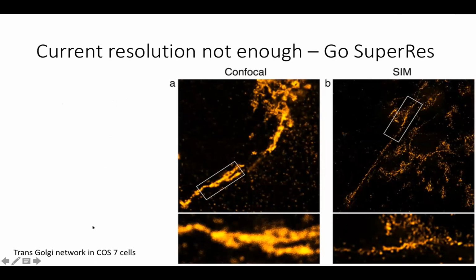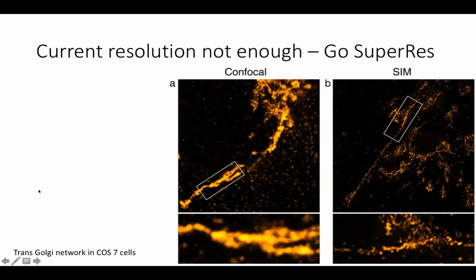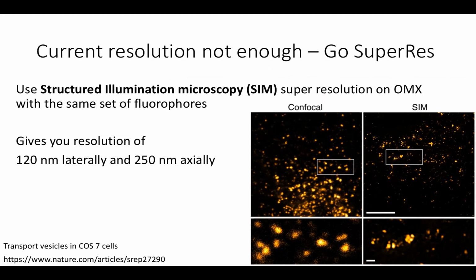Okay, now if you're not happy with this resolution, we just got a STED microscope, which I don't have a slide of, but the STED microscope can give you a resolution of 40 nanometers, right? So that's even better than this. So depending on the question that you are asking, we have different tools.